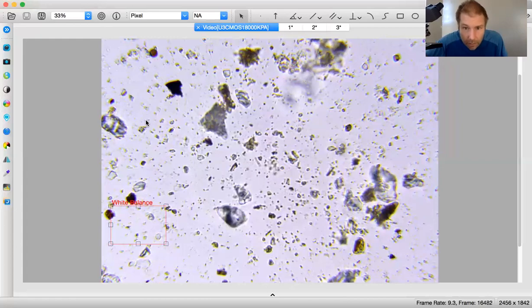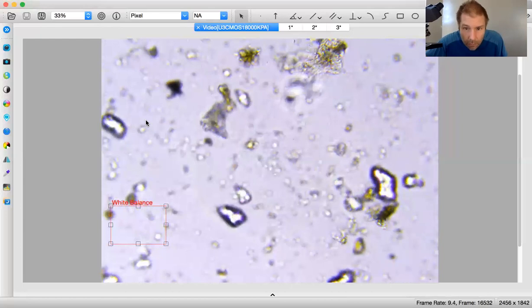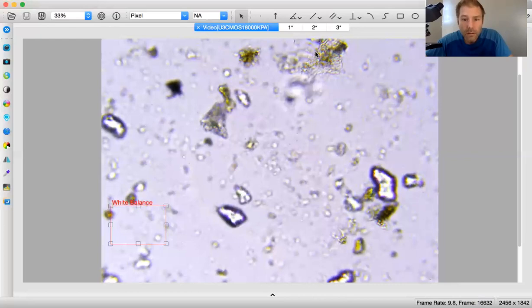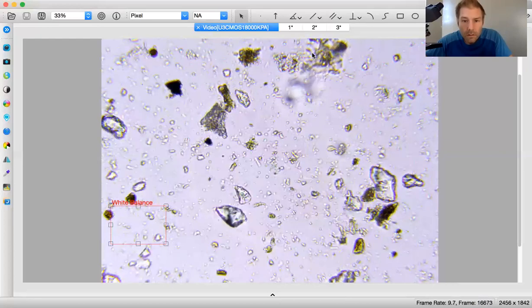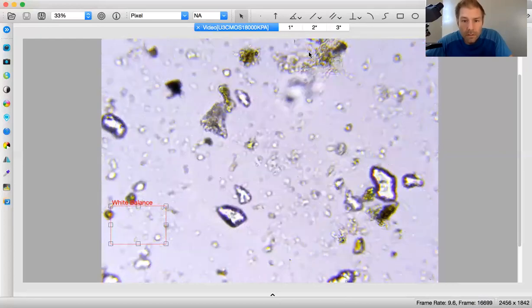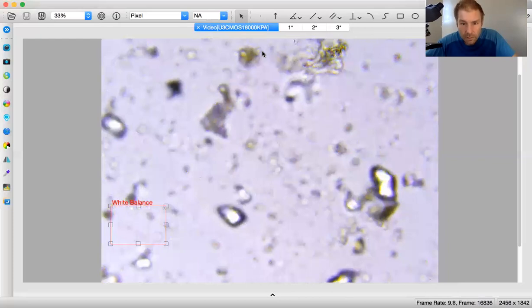Okay. All the way to the top. It's possibly a very fine piece of actino right here. It's got a good break on the end of it. If it is, that would be, oh. We got actino right here. I think the 2 of those together. Where's the other one at?